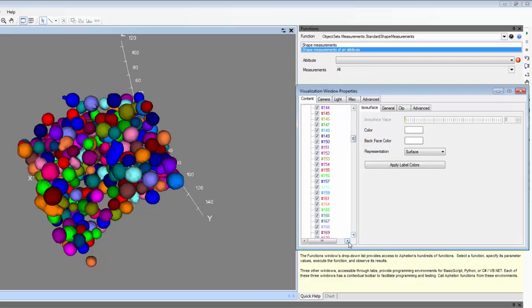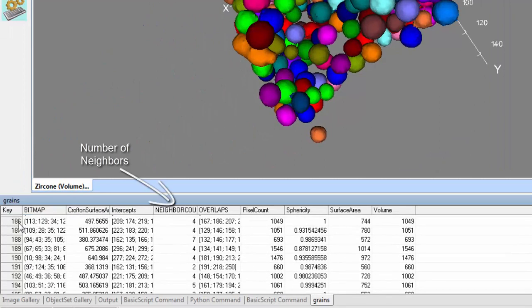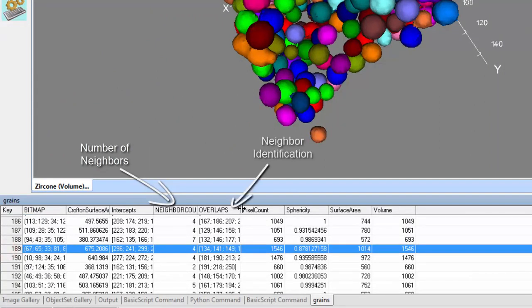Individual objects can be quickly identified simply by clicking on the object in the image. In this case, object 189 has been selected. In the table are the measured properties showing that this object has 4 neighbors.